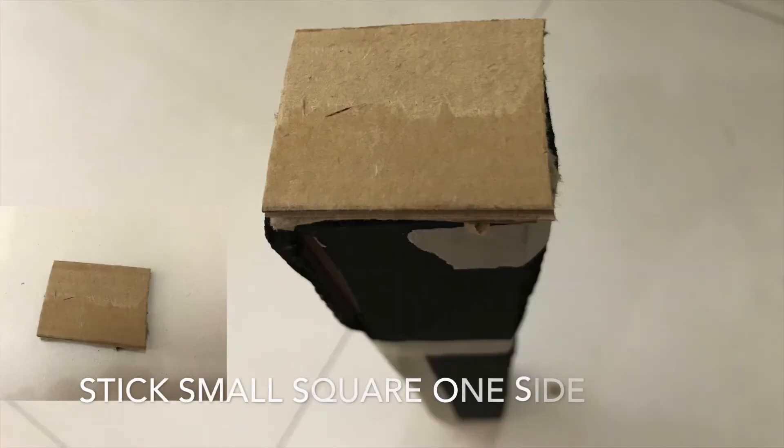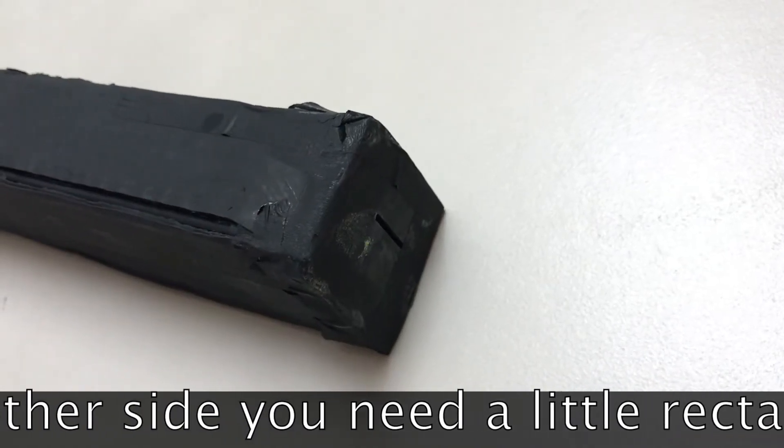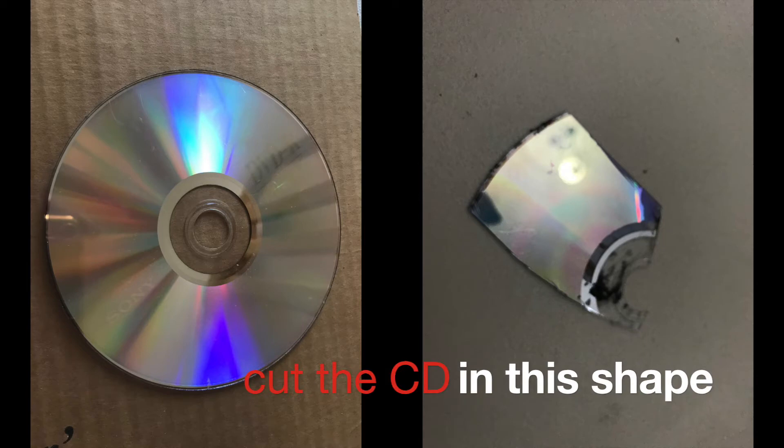Stick a small square to cover one side of the spectrometer. On the other side, you need a little rectangle gap to let the light in. Cut the CD in this shape.